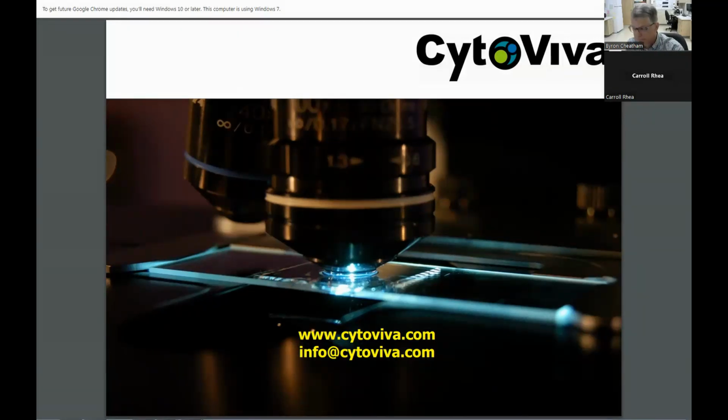Thank you. Next, what do the nanoparticles bind to in the cell? Well, and again, I'm not a cell biologist, and I'm not going to try to pretend that I'm one here this morning. But I've spent a lot of time in cell biology labs where nanoparticles are being utilized. And what typically happens is that the nanoparticles, well, they don't have to have a targeting peptide on them. If I had macrophages, for example, macrophages are cells that are designed in the blood system to seek out foreign matter and to eat it, to endocytose it, for example. And so in that case, nanoparticles that come in contact with a macrophage cell are going to get endocytosed by the cell and are going to be internalized by that cell.